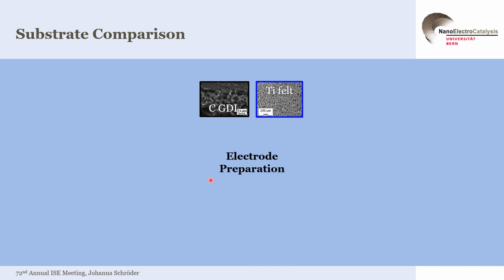Another aspect I was not talking about so far is the preparation of the working electrodes. And at this point now I want to talk about the preparation we are regularly using for the gas diffusion electrodes in our group, and I will compare what is necessary for the preparation of the titanium felt to measure it in the gas diffusion electrode setup.